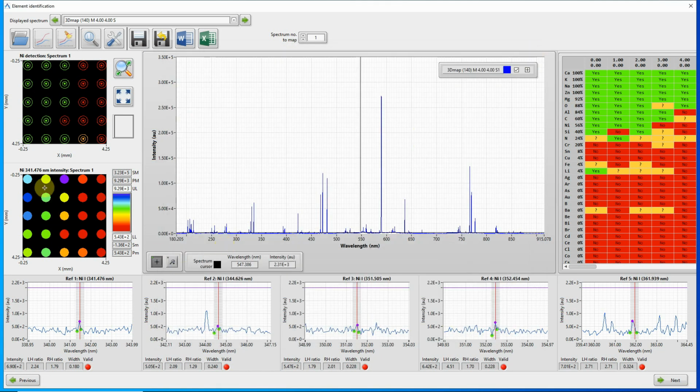The colour of each marker is defined by the scale to the right of the map here. A number of values are specified with the scale, and these are as follows. SM is the spectrum maximum, the maximum intensity in the currently selected spectrum number. PM is the peak maximum, the maximum intensity of the currently selected peak in the currently selected spectrum number.